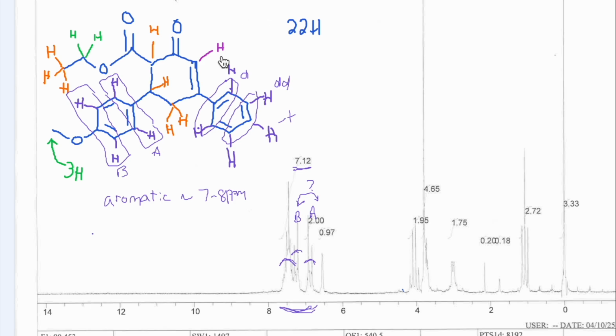The next proton that should be pretty high is a vinyl proton. Vinyl proton is normally 5 to 6. Remember, for the last compound that we saw, it was pushed up a little bit more into the aromatic region. It was underneath the benzene for the starting material for experiment 8. The product for experiment 7 had those vinyl protons pushed up a little bit further than 5 or 6, and this one does as well.